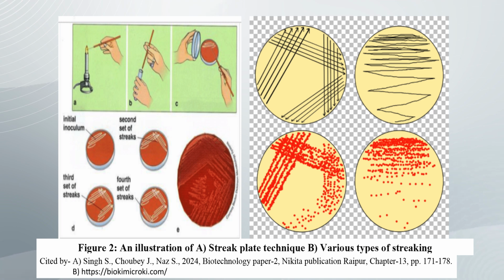It also finds great application in diagnosis purposes. This is the figure in which we show all types of streaking methods.